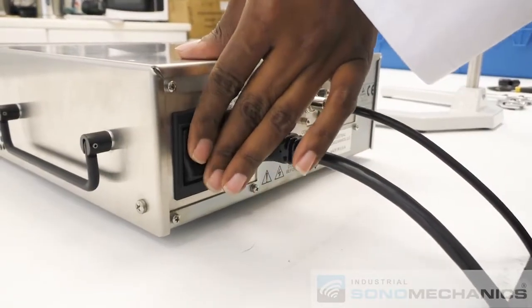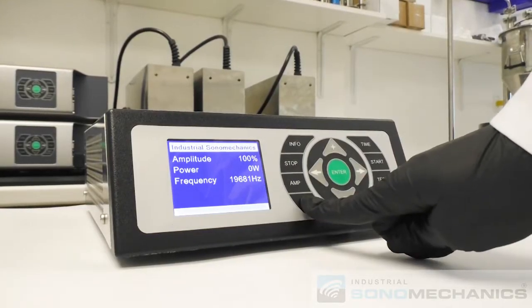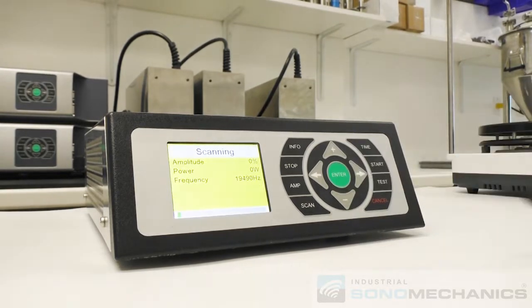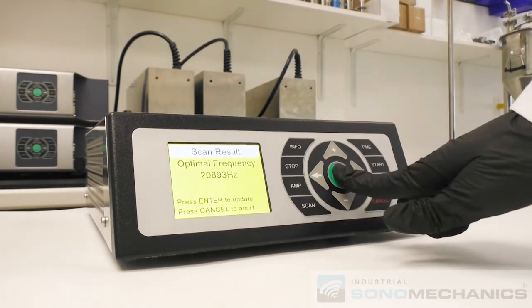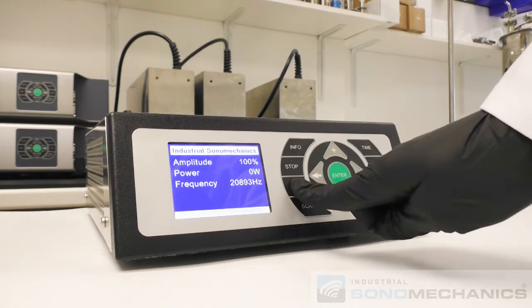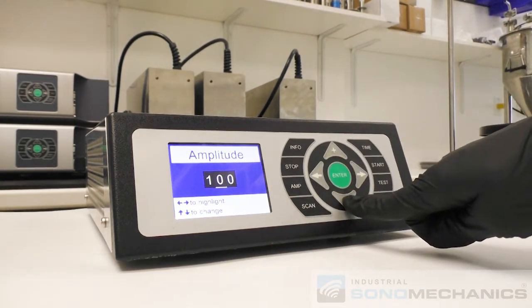Turn the generator on and perform the scan stack procedure as shown — see user manual for details. Set the ultrasonic amplitude to the desired level; see user manual for details.